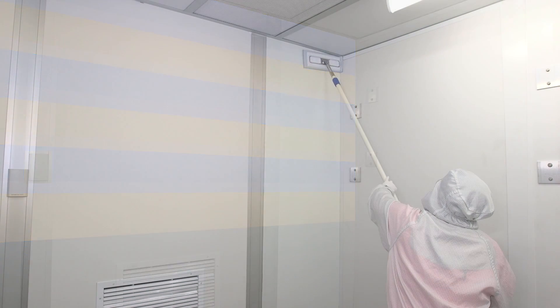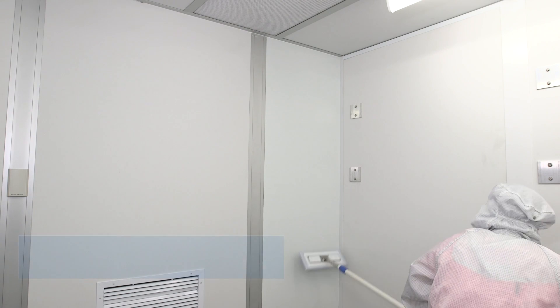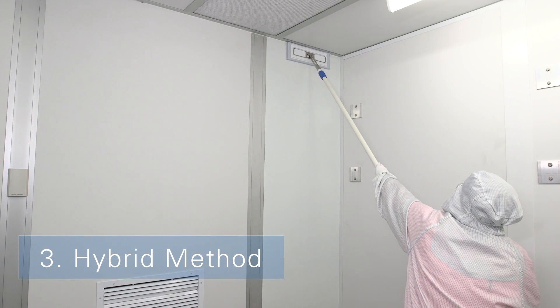Replace the mop head if it touches the floor. Continue this process until the entire wall has been cleaned. To disinfect, follow the same procedure using your facility's disinfectant.